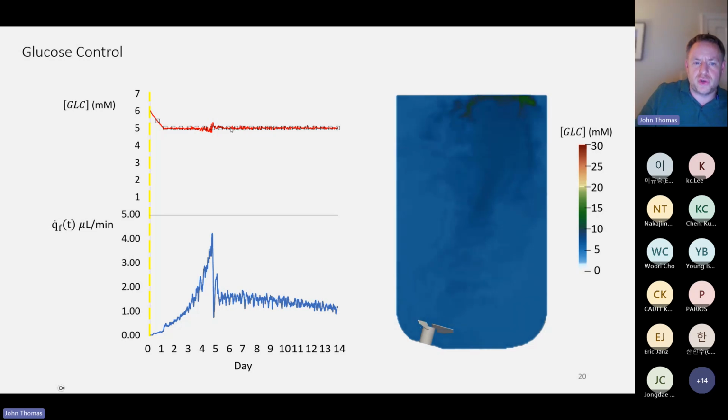this target glucose concentration. So what we're able to see here is how we might optimize the controller in a way that minimizes the difference between the realized and target glucose levels, and more importantly, what that controller is going to do. What is the maximum flow rate going to be? What kind of pump are we going to need? What sort of response times and PID parameterizations do we need? So we can use the simulation to tune and optimize the PID.